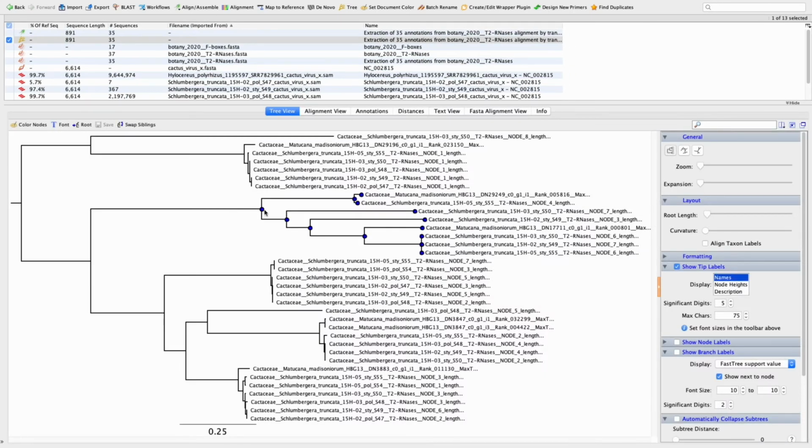This is the self-incompatibility RNase clade. Notice 2 alleles per sample, indicating they are heterozygous at the S locus. Also notice the interspecific polymorphism and the large divergences between the alleles. The divergences of other ribonuclease paralogs are much smaller. Additionally, all three Schlumbergera truncata samples share one sRNase allele, but not the second one.